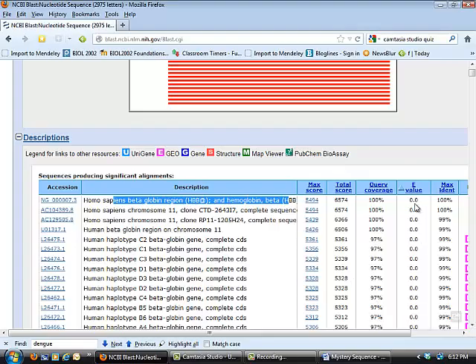Now the e-value is essentially telling you how good of a match what you found is. It's a measure of how likely something is to occur by chance. Because as you know, when you only have 4 different nucleotides, there's a certain probability that you'll coincidentally get something to line up with your sequence of interest, especially if it's short. We have a very long sequence, so our e-value is essentially 0 or very near 0. That's very good. It means there's essentially no possibility this occurs by chance.